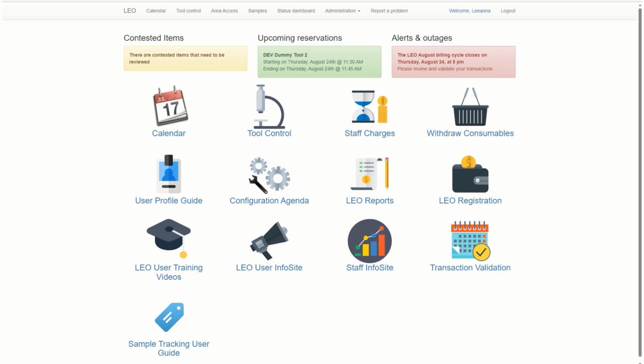Welcome to Leo. As a trained tool operator, you have access to the Leo calendar to make scheduled reservations for your personal tool usage. This video will demonstrate how to navigate the Leo calendar.